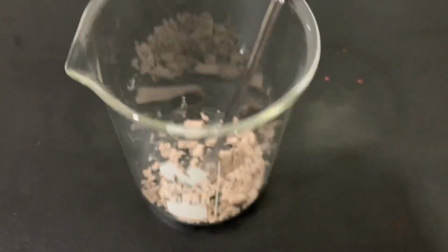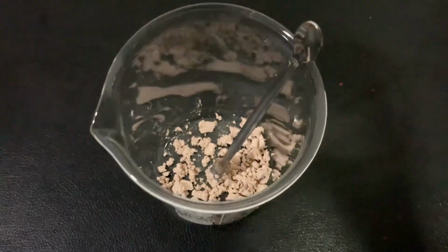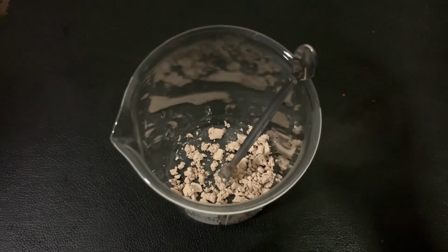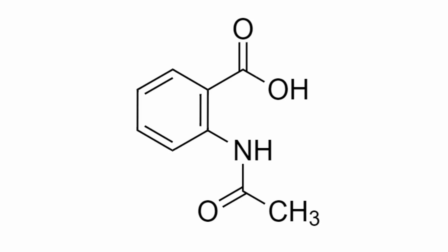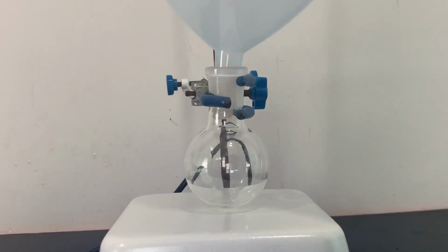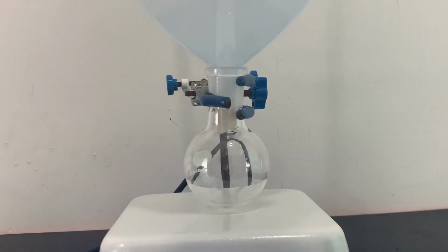I transferred all of the wet anthranilic acid to a beaker and dried it in the oven. The yield of anthranilic acid I got was 3 grams. Now that I have some anthranilic acid, I can begin making N-acetylanthranilic acid. To start, I added all 3 grams of the anthranilic acid I had just made into a flask.